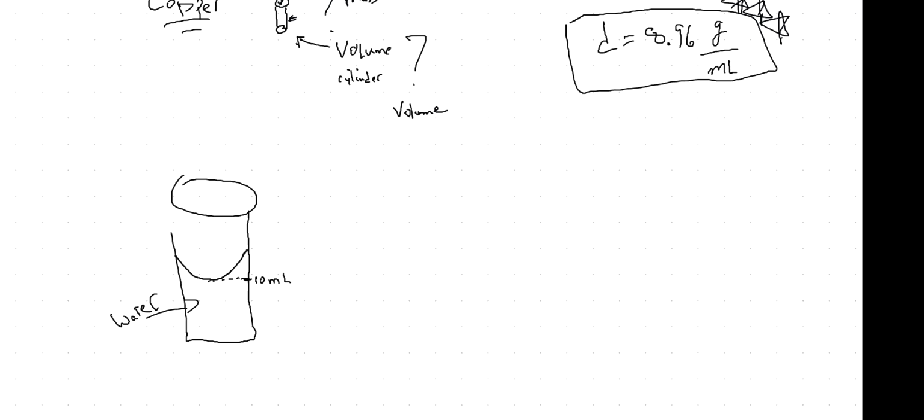Now what we want to do is put the copper cylinder in.